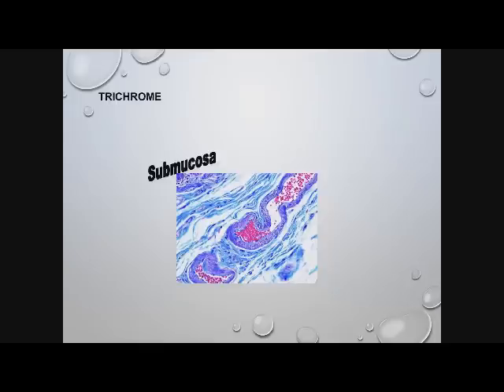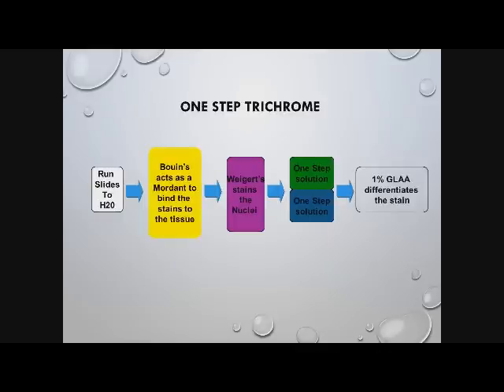The blue and the green is a little bit different, but you can actually see a little bit of muscle in between the blue collagen. It's a bright stain. A lot of people use it. A lot of people like it. And again, here we go. This is what it looks like.